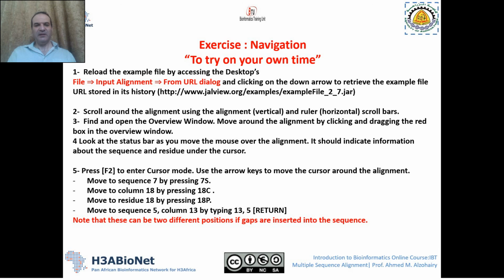This exercise will help you to navigate through the Jalview sequences, and it's very easy. Try, in your own time, to see the difference between these two possible navigating methods that exist in Jalview.